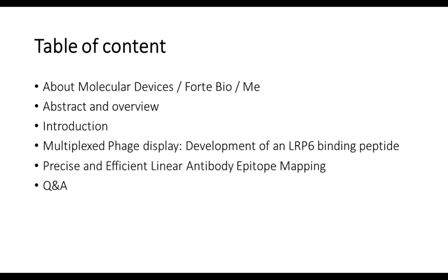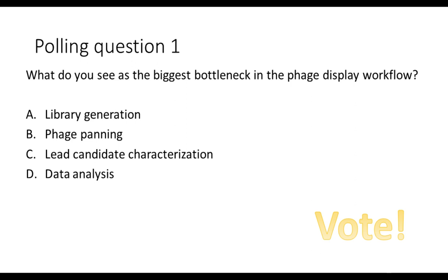This work has already been done. I have deliberately chosen this protein because it has already been done and we knew at least partly what to expect. As well as the second topic, which focuses on the throughput. Since we're stating here to have a high throughput phage display technology, I will also show you an example where we have taken advantage of this technology to its full extent. And at the very end, we have obviously the Q&A session.